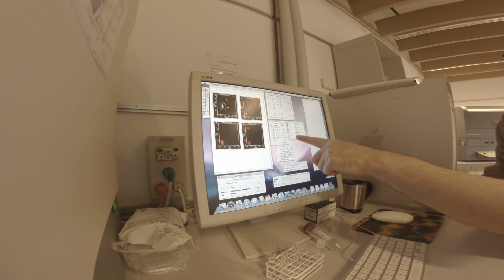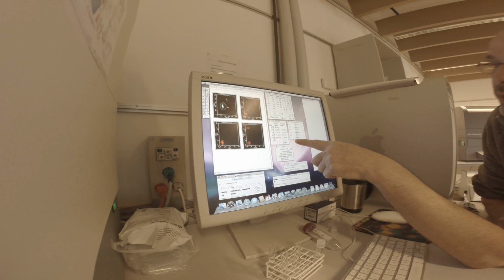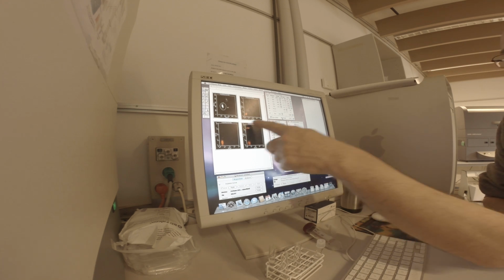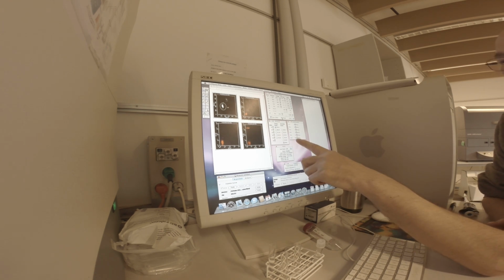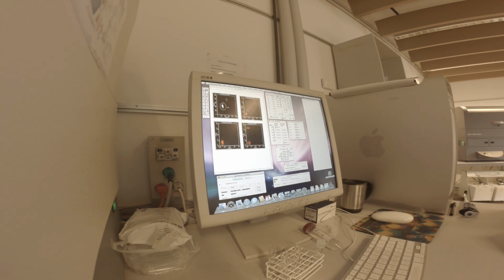I had a feeling that because I know the numbers, they should be like this. Yeah. And the numbers also tell you that you are fairly correct, because notice that you have much less going from 4 into 3, that value, compared to 3 going into 4. Yeah. And that is because the peak is always very steep, and then there is a tail. Okay. So you have a lot that are going into the neighboring channel. That's the high percentage. Yeah. But this one is steep, so only a little bit goes into the first peak.